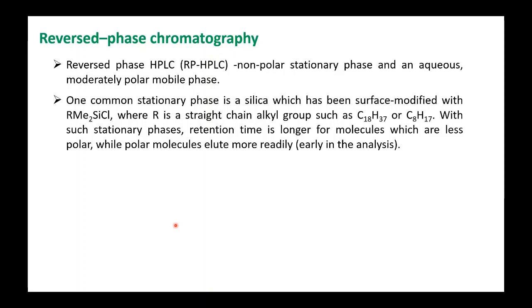So generally what we do is separate the polar organic compounds, right? And that's why the reverse phase column is more efficient in HPLC to separate the polar compounds over the non-polar. Suppose you have a carboxylic acid. I think some of you have the experience from when you have done the TLC.